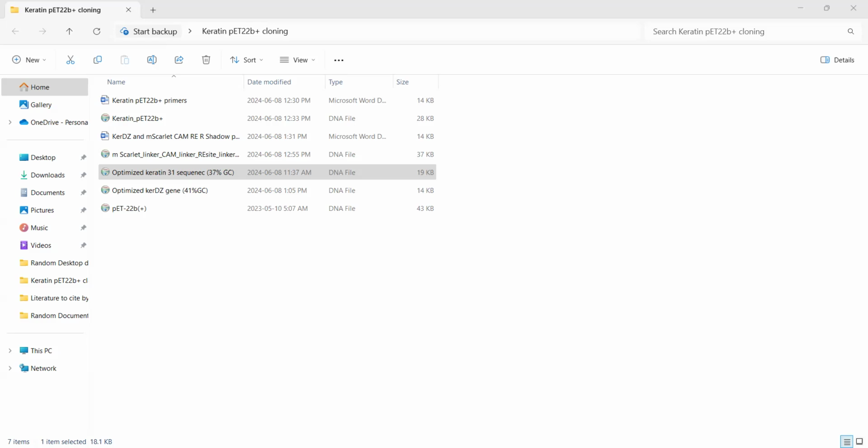So this one had 21 base pairs. I usually try not to have primer that is shorter than 18 base pairs, and I try to end the primer with G or C, just because bonds between G and C are triple, which means it's going to stay more tightened to the DNA, so it's a stronger bond.